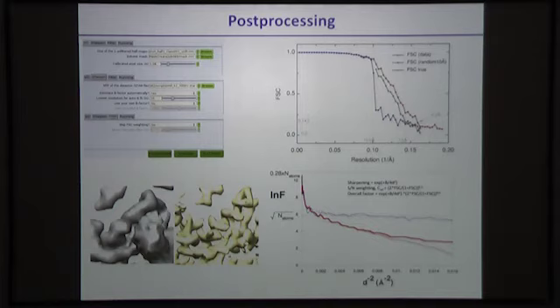And the reason why you need to do this is because during the whole process of imaging, acquisition of data, and processing of data, the high resolution frequencies are dampened. You can estimate this as a B factor that you can apply in order to sharpen them up and bring this up again.